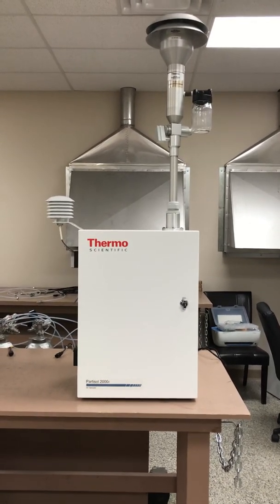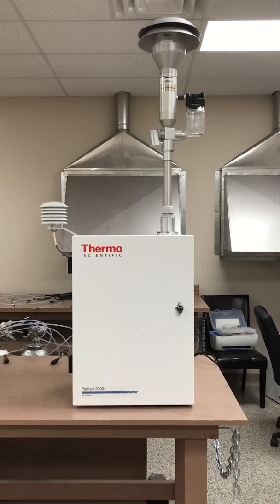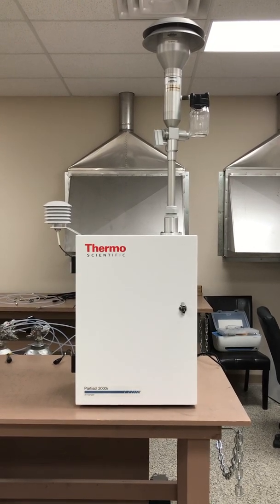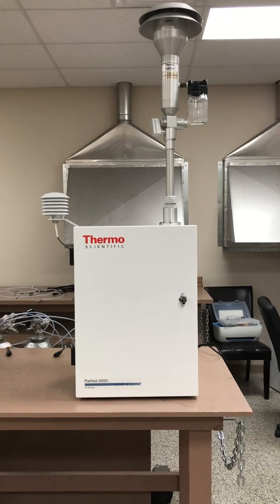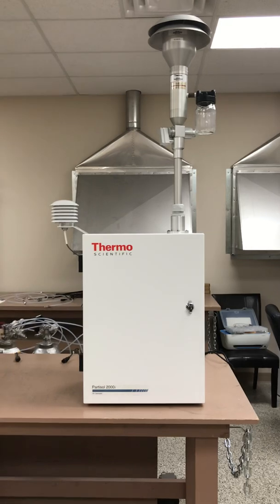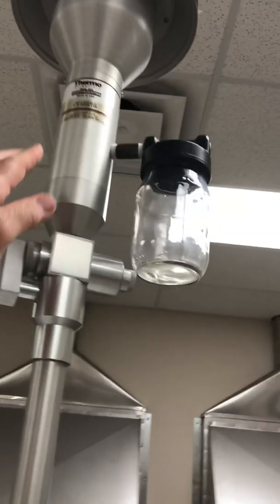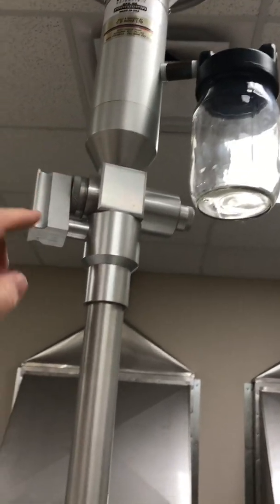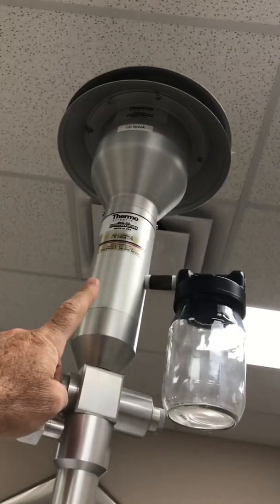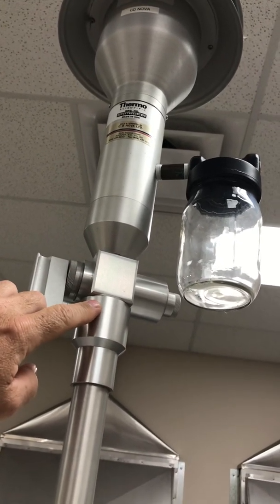Hi everyone, Jim with CD NOVA Instruments again. Today we're looking at the Thermo Scientific Model 2000i Partisol Sampler. This is a particulate high volume sampler, commonly used in Canada for the NAPS sample program from coast to coast. This unit has a PM10 inlet on the top, combined with the Sharp Cut Cyclone for PM2.5, so it'll cut to 10 microns here and then reduce it to 2.5 microns here.